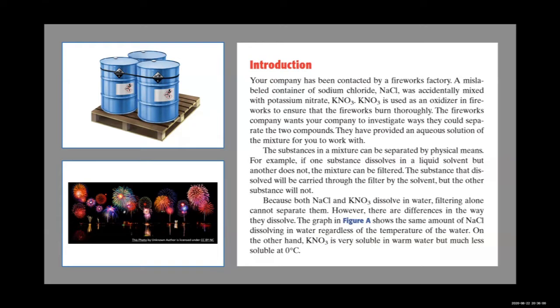Introduction. Your company has been contacted by a fireworks factory. A mislabeled container of sodium chloride, NaCl, was accidentally mixed with potassium nitrate, KNO3. Potassium nitrate is used as an oxidizer in fireworks to ensure that the fireworks burn thoroughly. The fireworks company wants your company to investigate ways they could separate the two compounds. They have provided an aqueous solution of the mixture for you to work with.